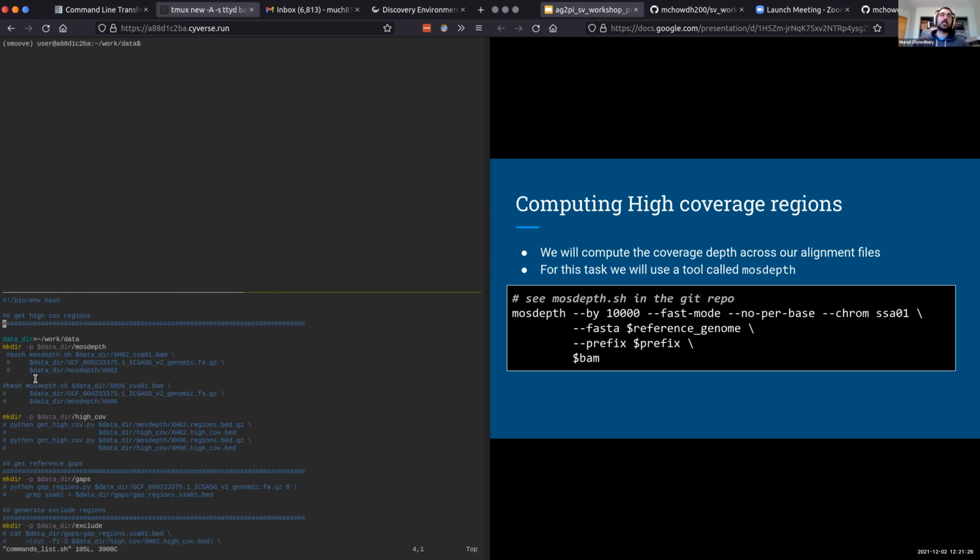At the top, I've got the mosdepth command here, and we're going to be running this on the two genome samples that we had. In this particular case, we were running it on two Alaskan salmon whole genomes. We've reduced them to just one chromosome for the demonstration, just to make sure that run times are reasonable as well as file sizes. We're going to start off by uncommenting this. The way I do it in Vim, if you're not familiar, is you can go over the cursor with your arrow keys and hit the X key and it'll delete characters. Perhaps some of you already know how to do this, but for those who have never used it, you can just use the X key to delete individual characters and delete the comments.